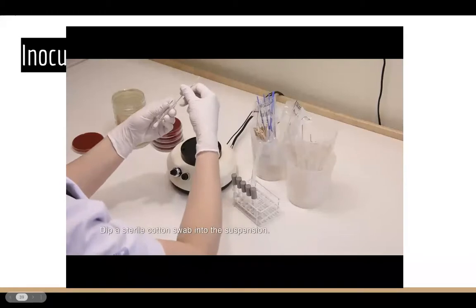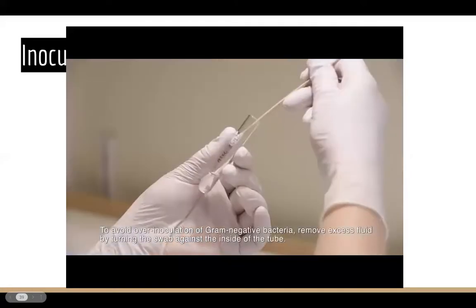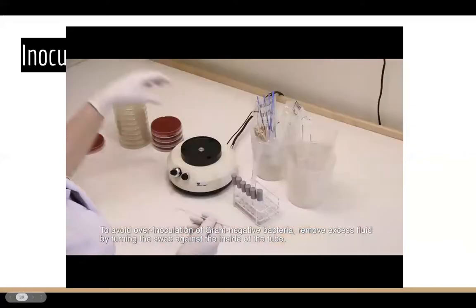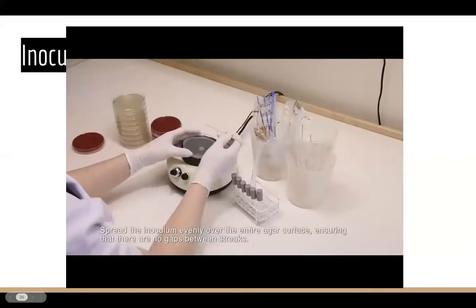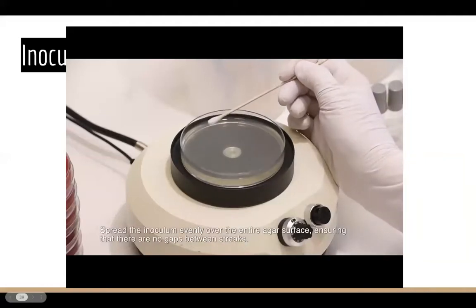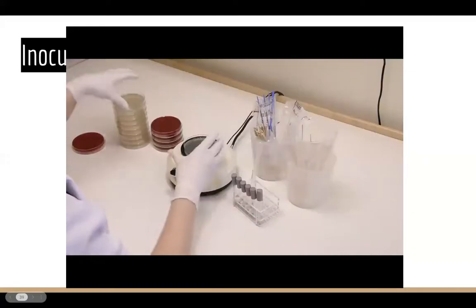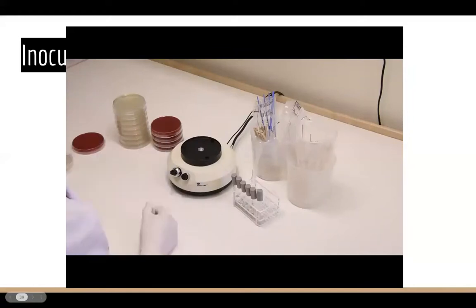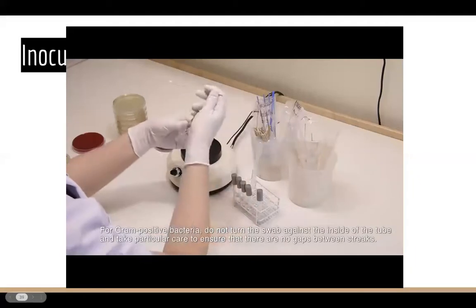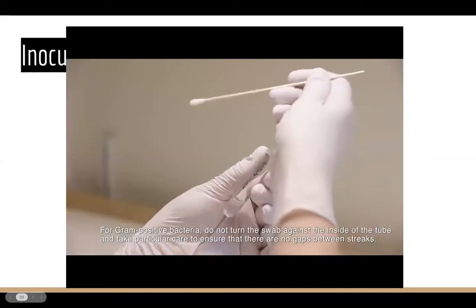Dip a sterile cotton swab into the suspension. To avoid over-inoculation of gram-negative bacteria, remove excess fluid by turning the swab against the inside of the tube. Spread the inoculum evenly over the entire agar surface, ensuring that there are no gaps between streaks. It depends on whether you're using gram-negative or gram-positive. If it's gram-positive, it's fine for the swab to be very wet. For gram-positive bacteria, do not turn the swab against the inside of the tube, and take particular care to ensure that there are no gaps between streaks.